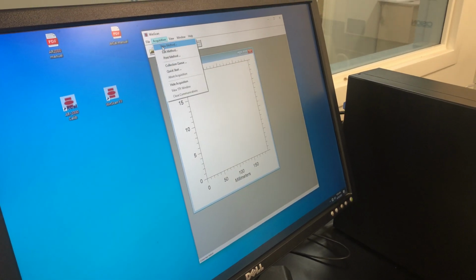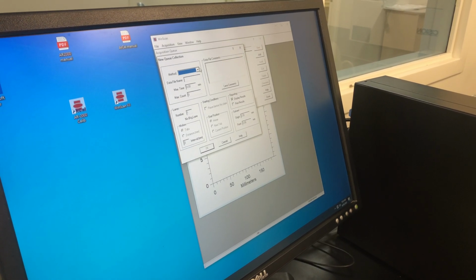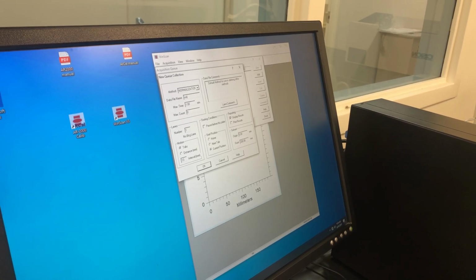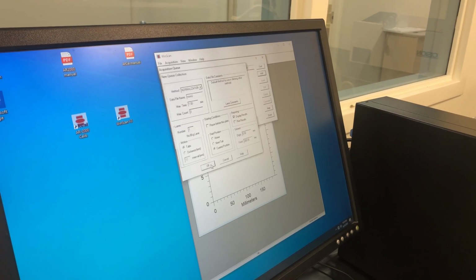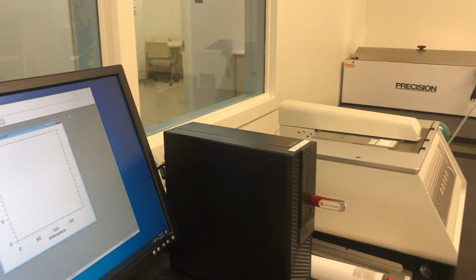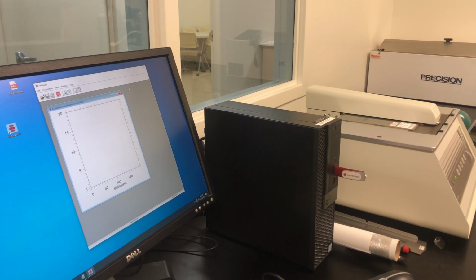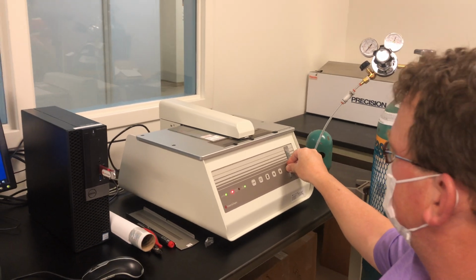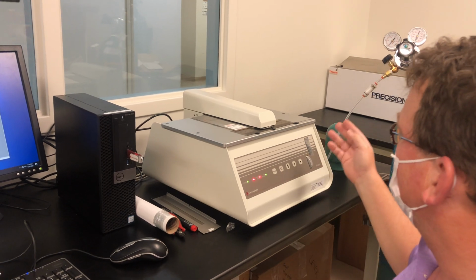So now we've got to set up another acquisition. Add method, normalization, file name norm2. Display everything's good. Hit OK. Now we can hit start when we're ready. I wasn't ready last time. You want to adjust this wheel so that the flow rate is between 2 and 2.5, anywhere in there, 2.5 liters per minute.